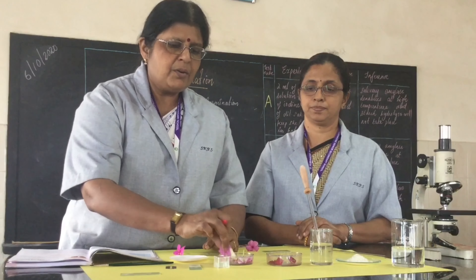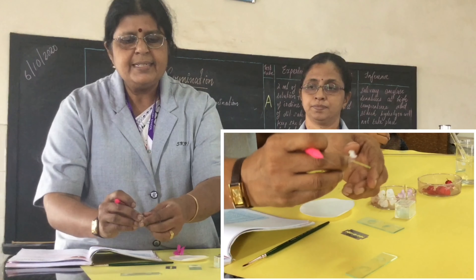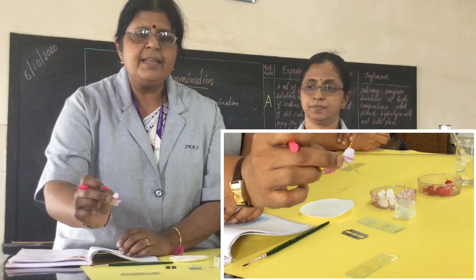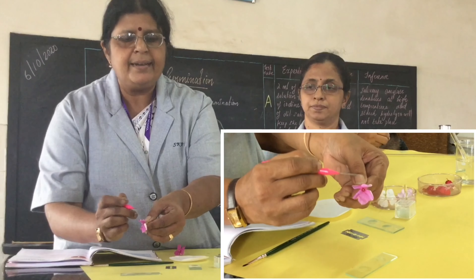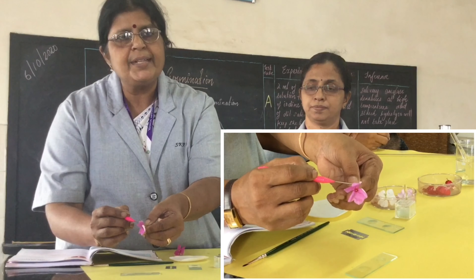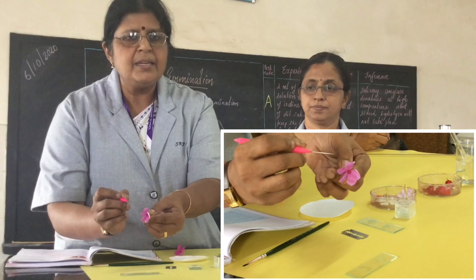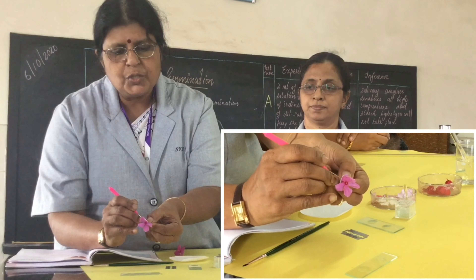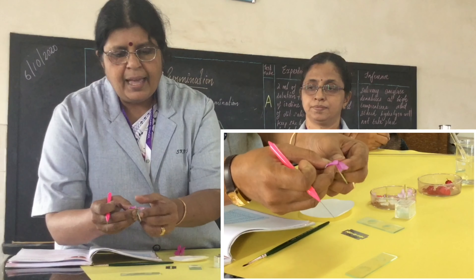Next, for Vinca rosa — how do we take the anther or the pollen grains? In Vinca rosa, the stamens and anthers are present at the corolla tube, just below the petals where there is a small enlargement. At the neck of the corolla tube you can see the stamens with the anther lobes. Using a blade or needle, make a small cut on that corolla tube neck region, very close to the petal, to expose the anther.